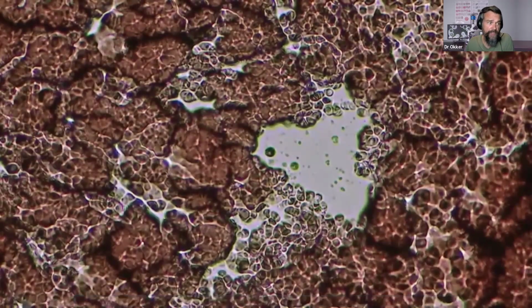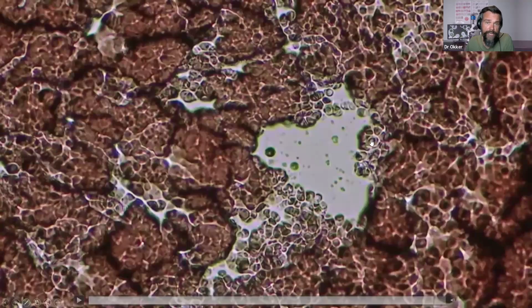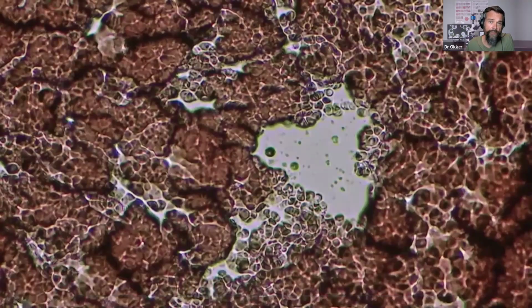If we see lots of these dots within these white areas in the dry blood sample, the more we see, the more it is connected to the risk of degenerative diseases, potentially serious conditions as well. So this is a very useful way to actually track in cases what we need to focus on and what potential challenges might be lurking in the background as well.